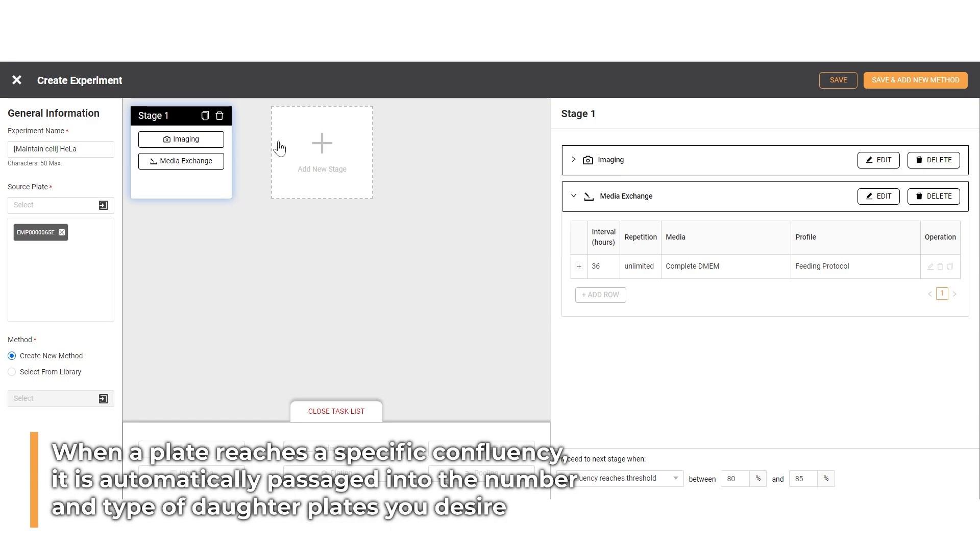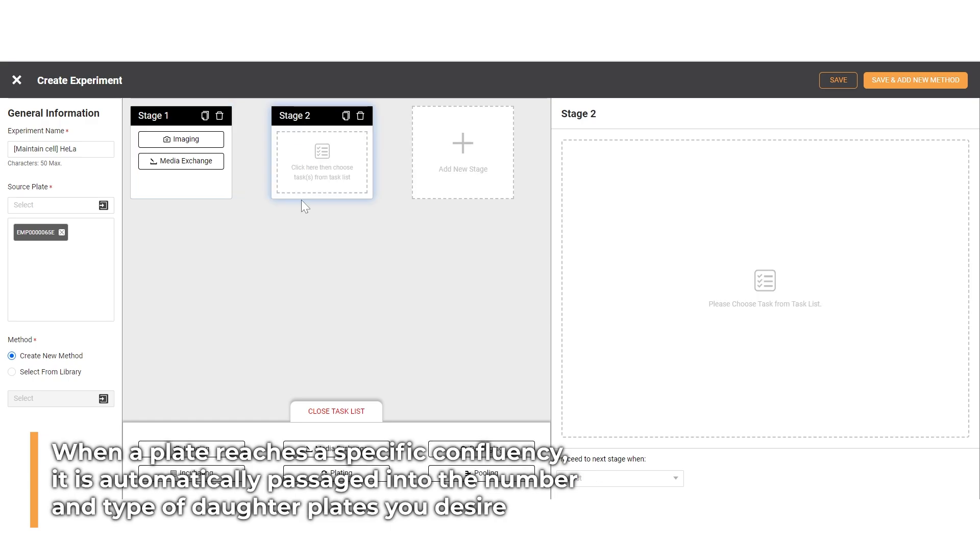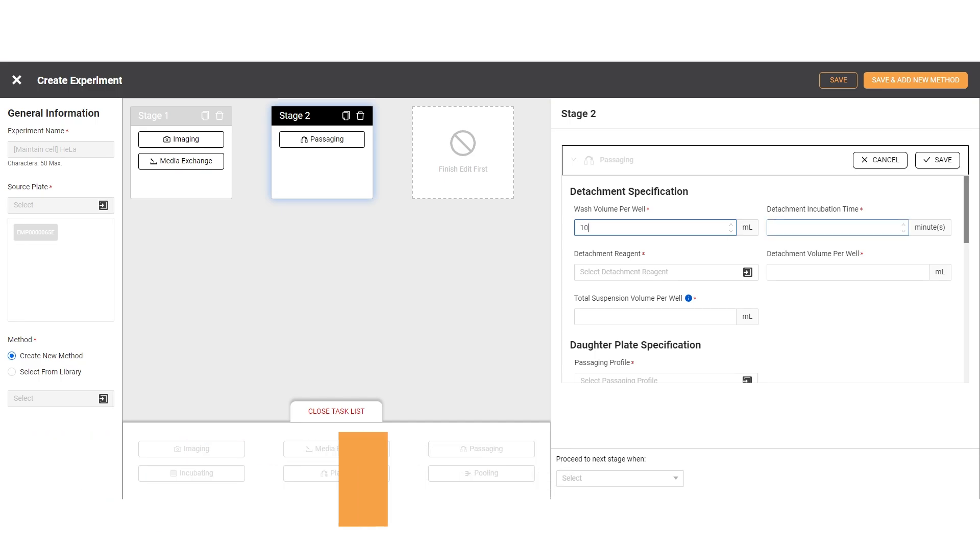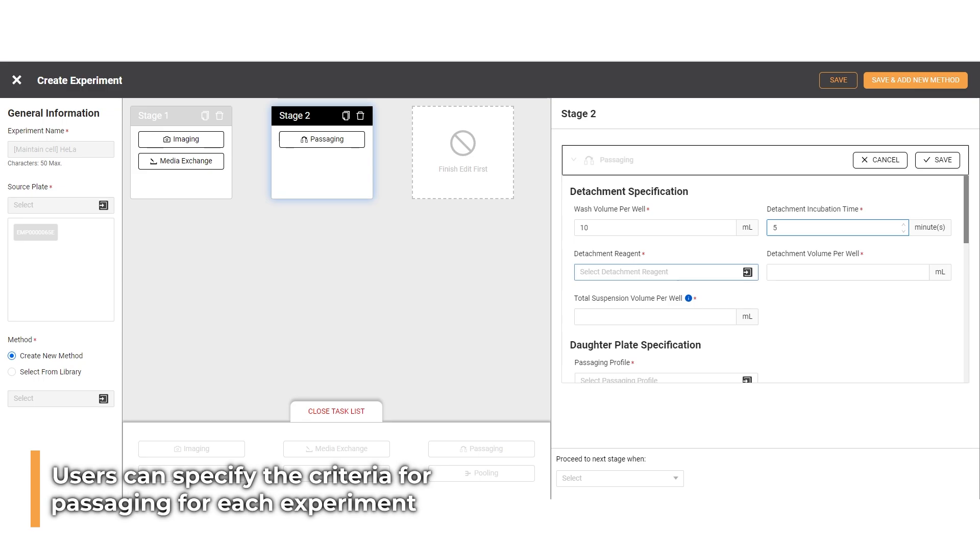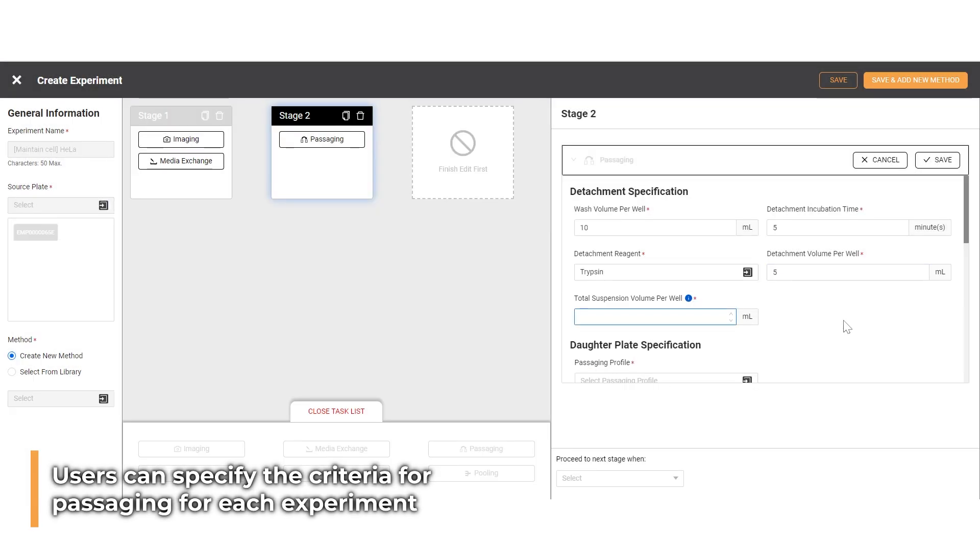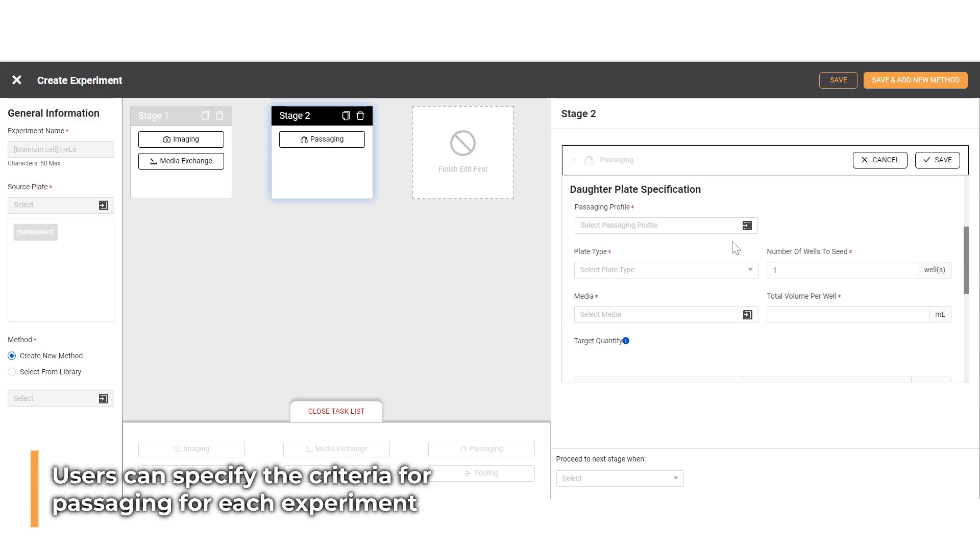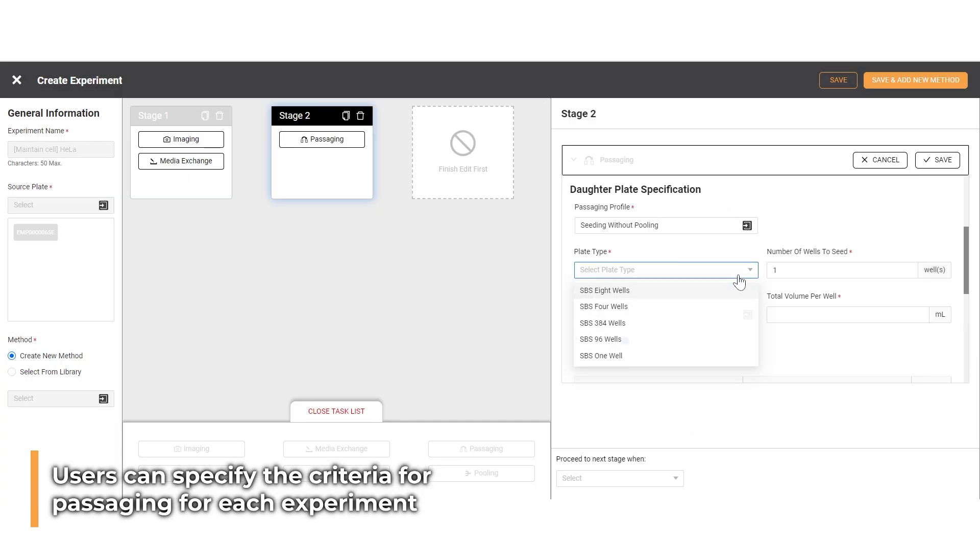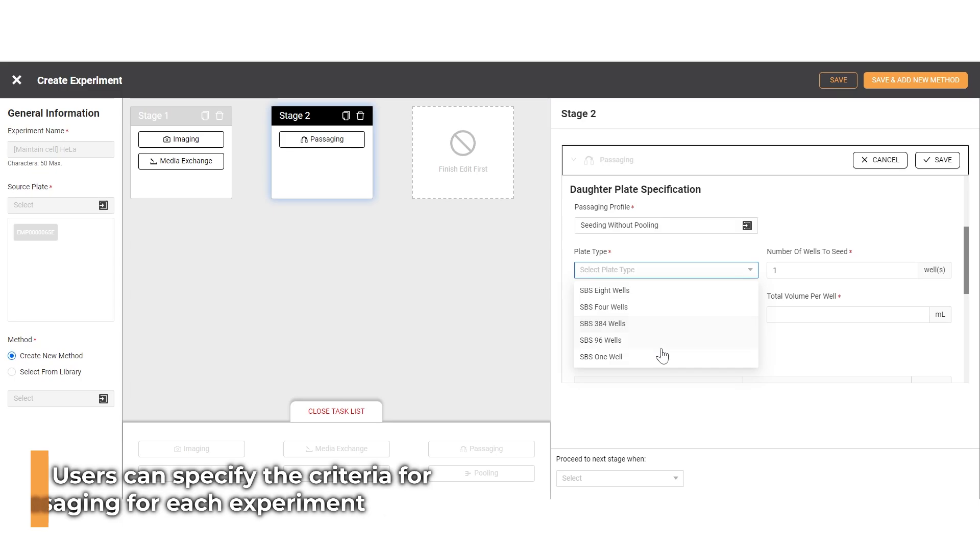The second task will be the passaging stage, which transfers cells from a mother plate to a daughter plate when it reaches specific confluency. In this stage, the detailed information about passaging criteria such as detachment process, type and volume of media, ratio number, and type of daughter plate are adjustable according to the specific experiment.